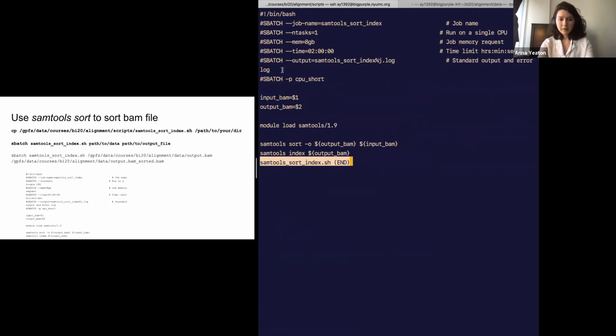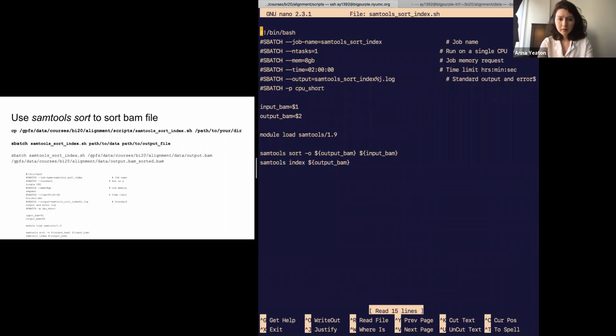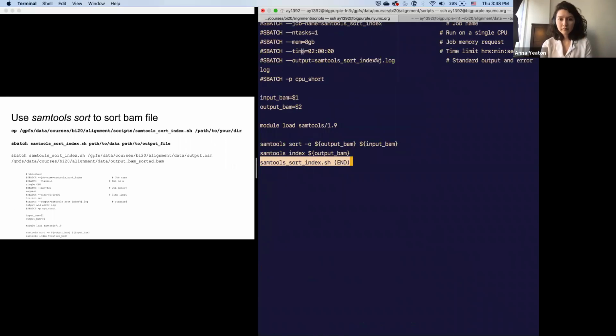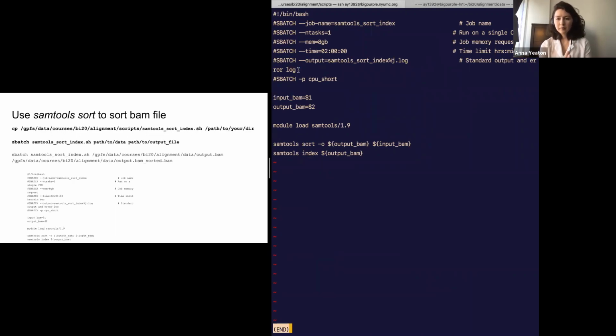And I have a typo up there, that's not good. Oh no, I don't have a typo. Whoops, sorry, false alarm. I thought that was a different line, but it's just from this line up here, so that's okay.